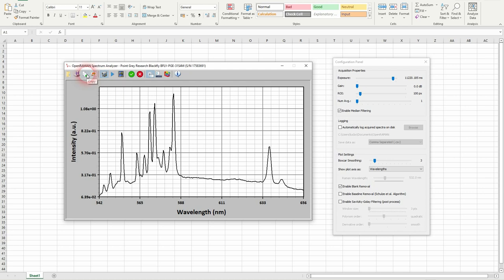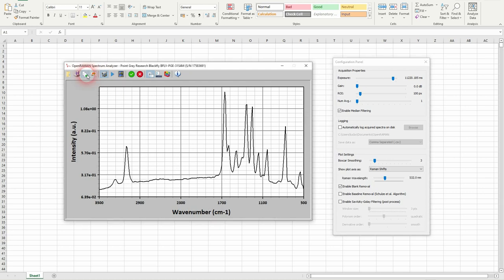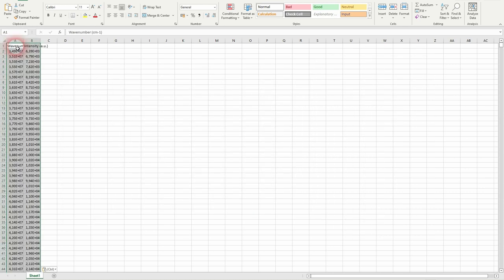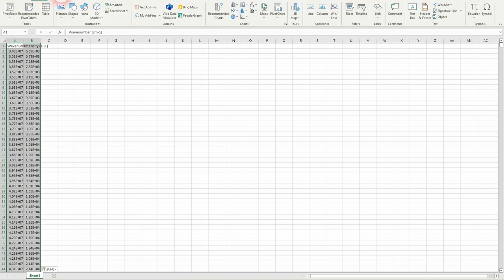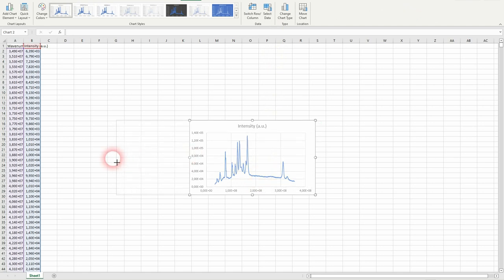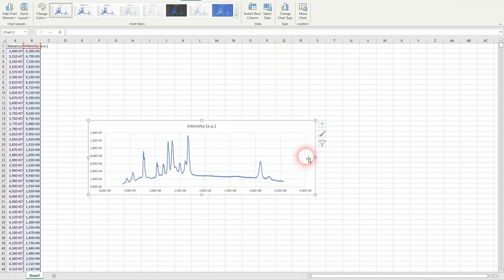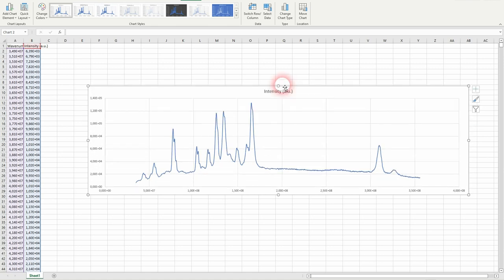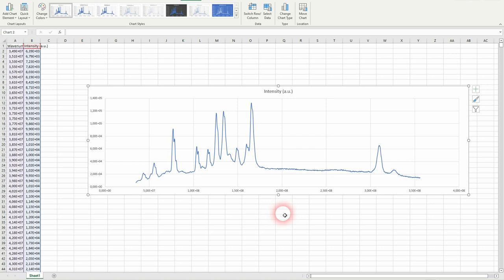Obviously I will copy the spectra, put it in Excel and that's our spectra with all the peaks that you can compare to database. So it's a relatively clean spectra despite we are using the starter edition, so it's really perfect for teaching application.